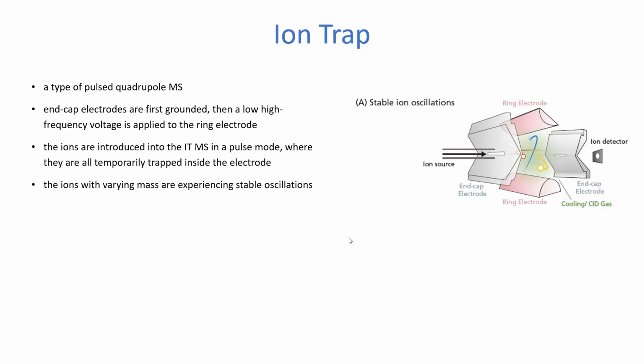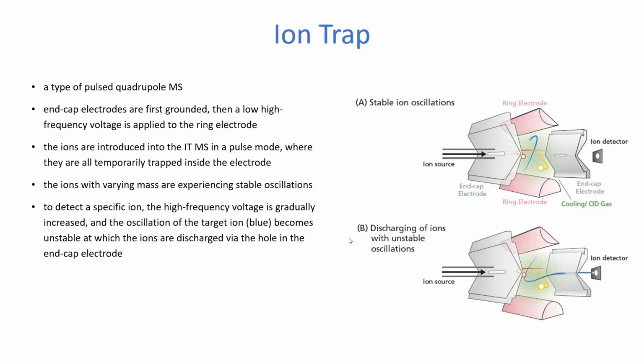And it's by modulating that with the applied voltages on the electrodes that you can change the shape of those oscillations, and you can intentionally select certain ions, and you can knock other ions out by having them hit the walls of the trap.